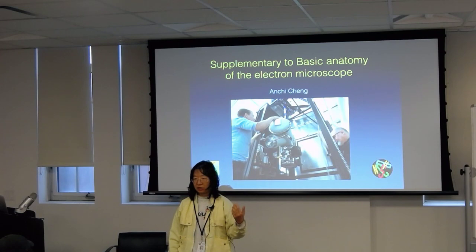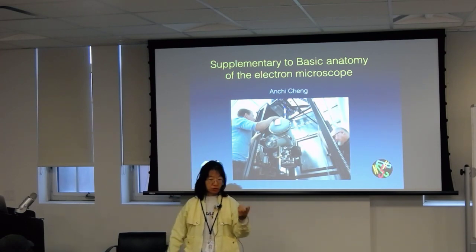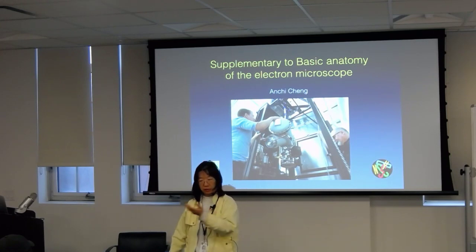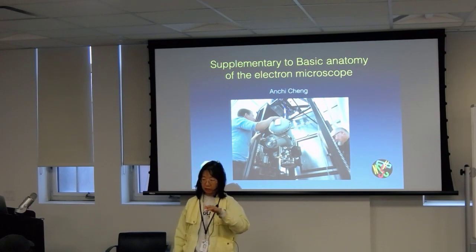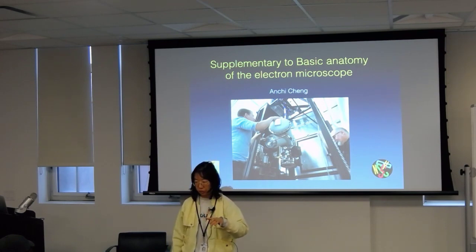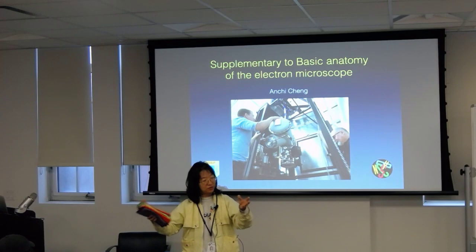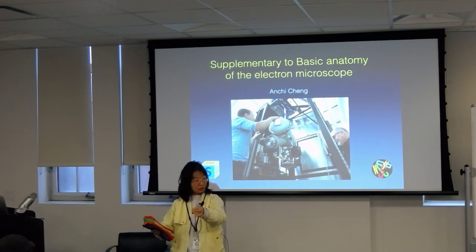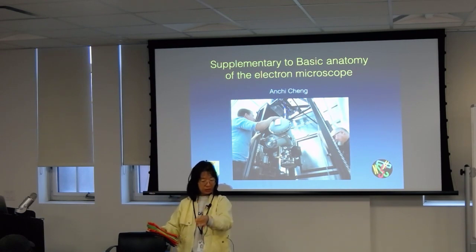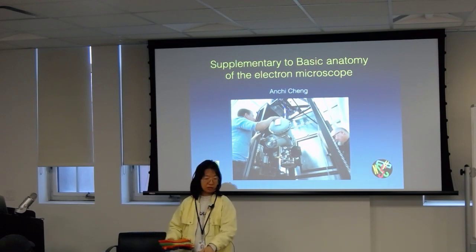In fact, usually it's far from perfect. Each of the microscopes that you've seen, lower end and high end, will have all these parts. And then the last component is an aperture. The purpose of the aperture is to make sure that, for the parts that are not so perfect, you can still take whatever is in the middle, which represents the best that you can get out of this whole system, to pass to the next part.